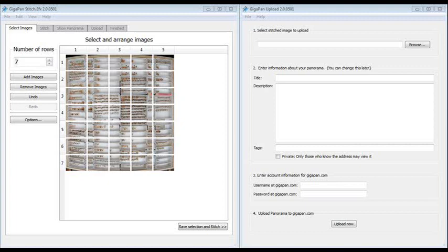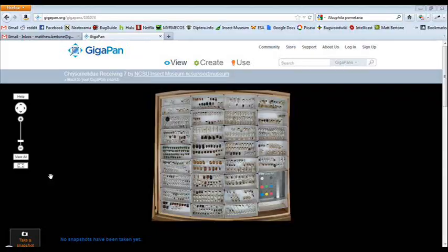After being processed, panoramas can be exported as large images, viewed using the software, or, if uploaded, accessed online at GigaPan.com. And that's it, you now have panoramas of insect drawers.